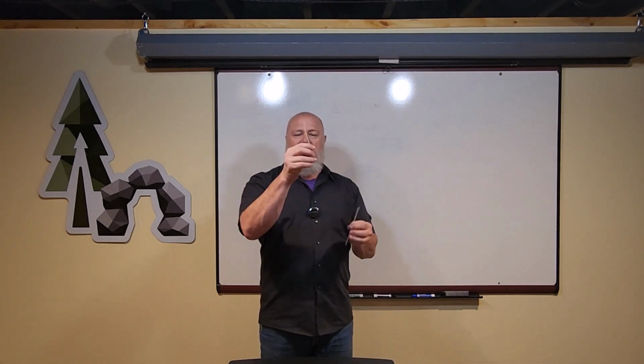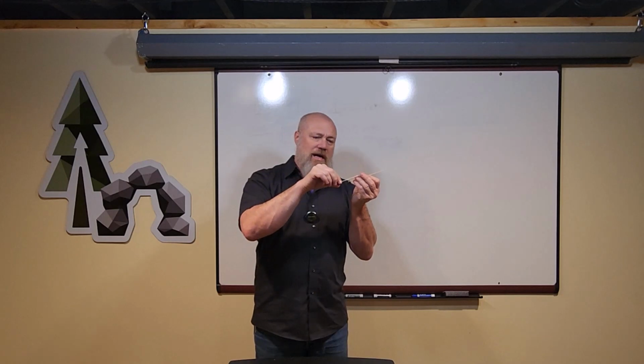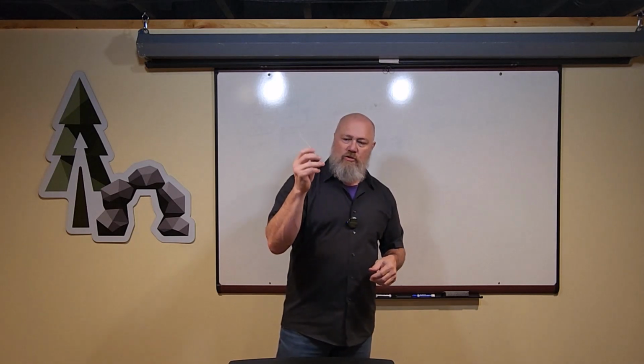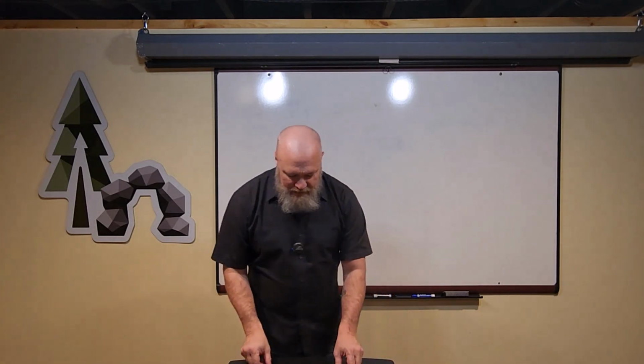You're also going to be able to use these little wooden sticks. You can use these for lots of things. You can get behind blood vessels and nerves to help them stand out from the region so you can see them, and they're super cheap. They're just not as strong as the steel blunt probe.